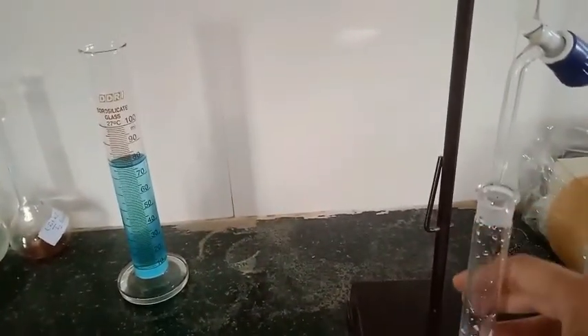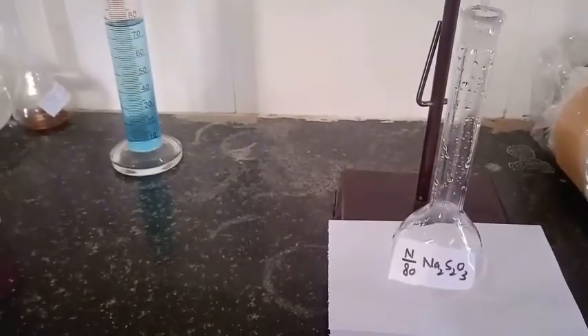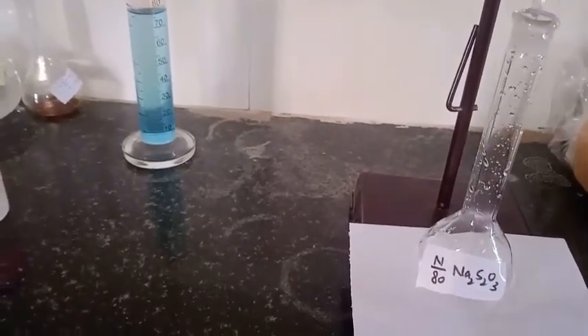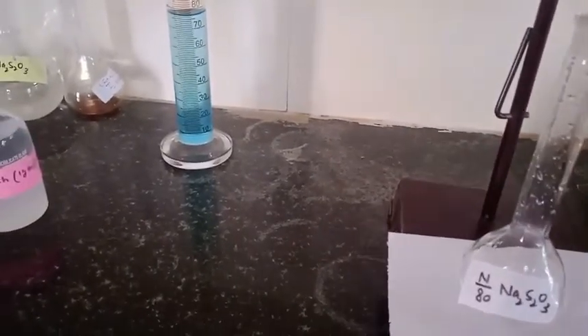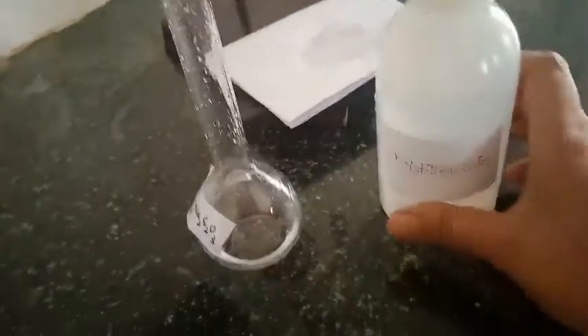To prepare the N/80 solution, I am taking 12.5 mL of sodium thiosulphate (already in the burette) into a measuring flask. After adding 12.5 mL of N/10 sodium thiosulphate solution, I stop and confirm the reading is 12.5 mL in the measuring flask.